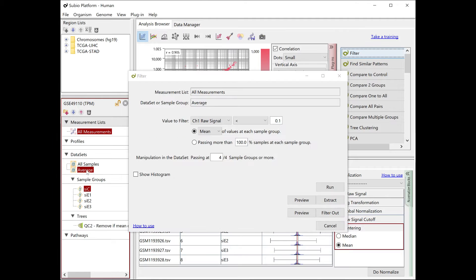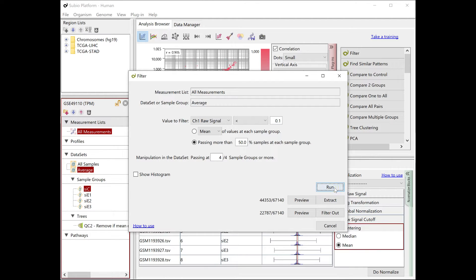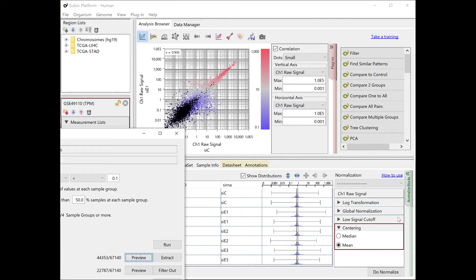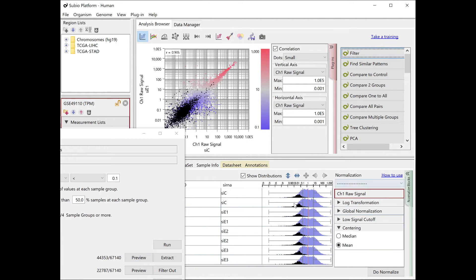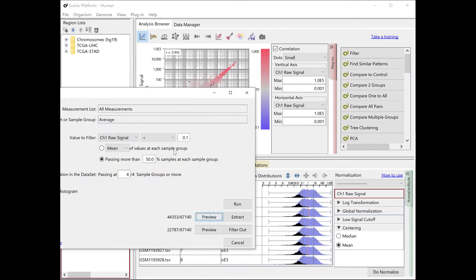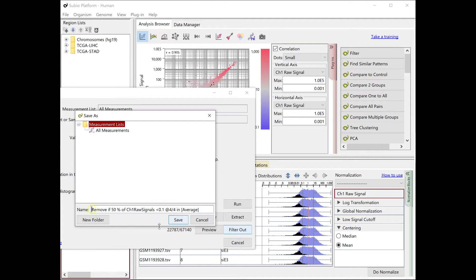The target genes are with TPM less than 0.1 at either one of duplicates in all groups. Check the filter passing genes in the viewer. Exclude them and make the QC1 list.